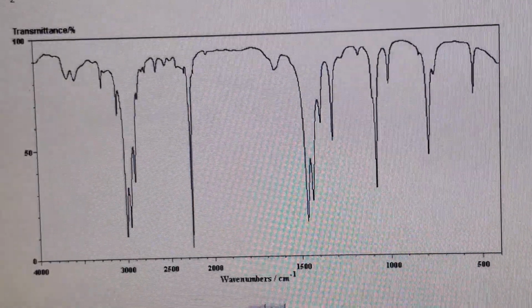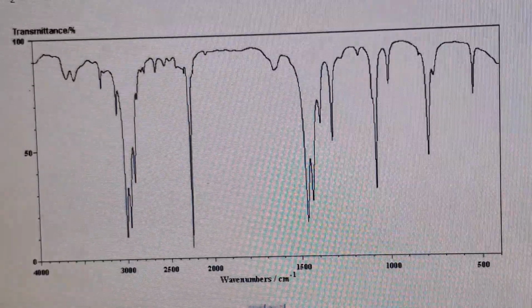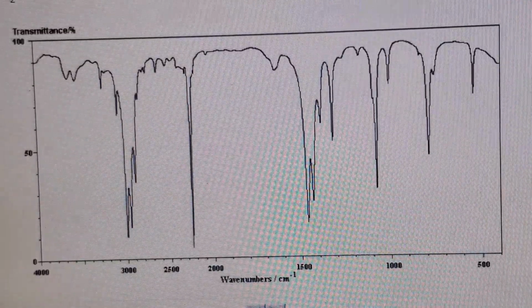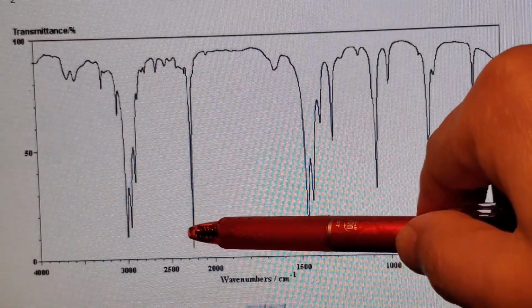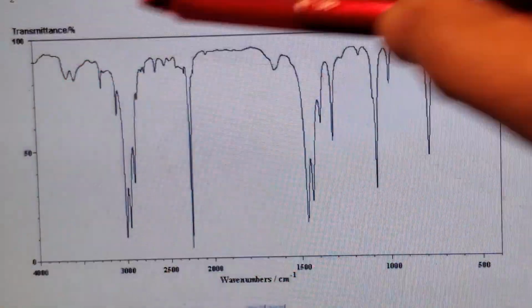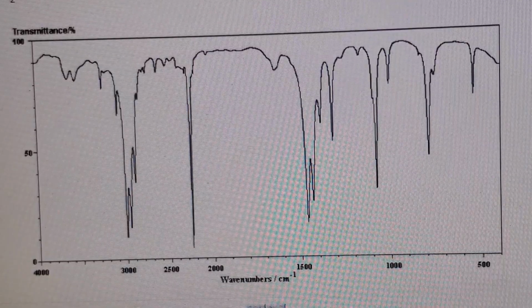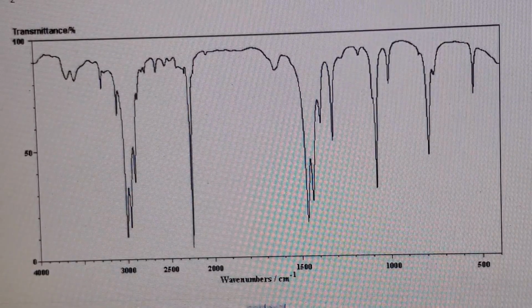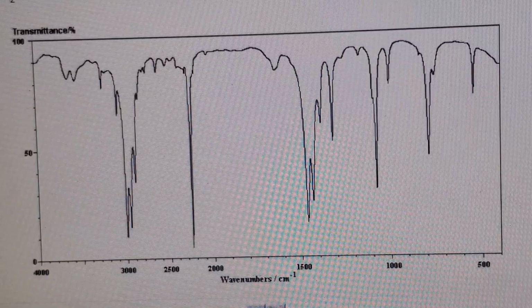If you do have other evidence, I will give a few seconds to check on other signals, such as the presence of alkene in addition to the cyanide, and also these peaks. But otherwise, that's it. So yes, this is the practical experience that teaches you about the real example.